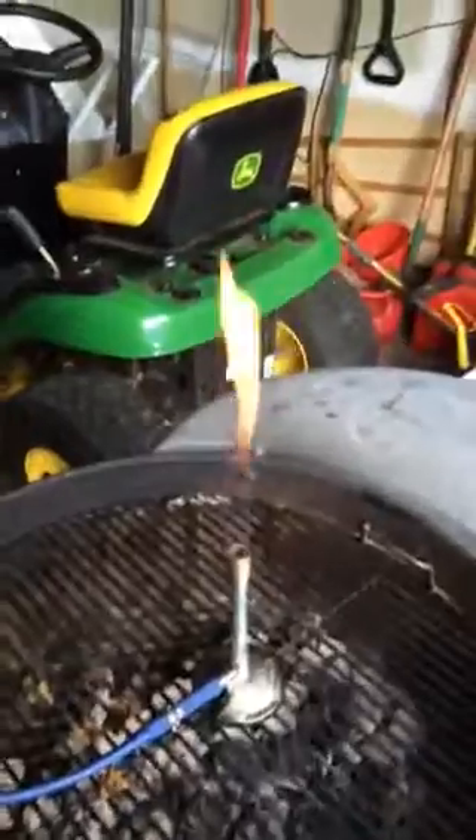Without further ado, let me set this thing up. I'll turn the gas on and then use the spark generator. So we need to ignite this. It's going to look like that with these things closed. You can still have it on high if you want. This flame is an incomplete combustion flame, so it's kind of a dirty flame.